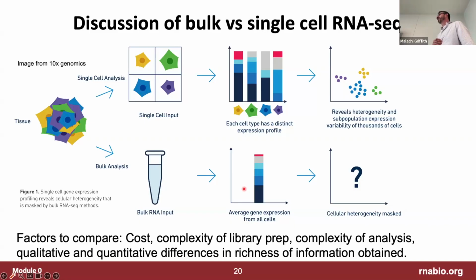And it's not easy to tell from the output whether we are getting double nuclei output. I think the baseline assumption is that the nuclei will be separated, but the binucleated cells will be more likely to form a duplicate, but we haven't been able to quantify that convincingly.